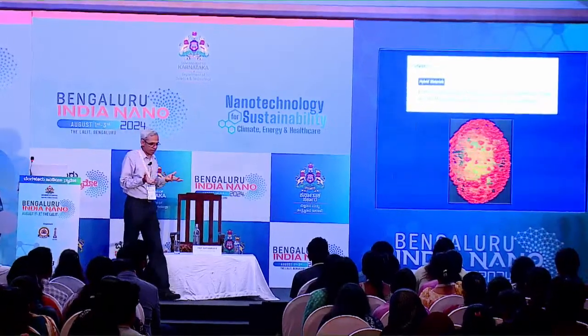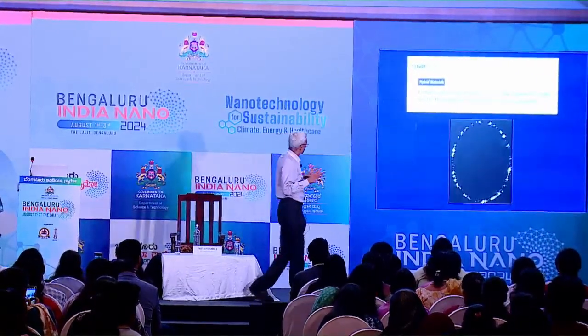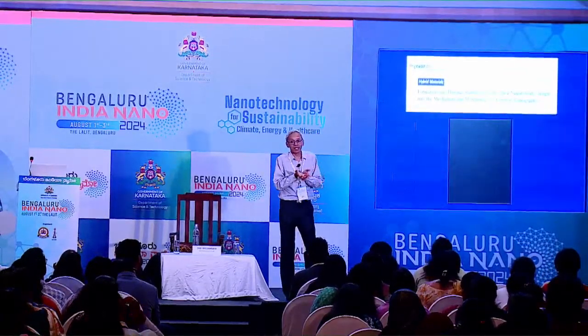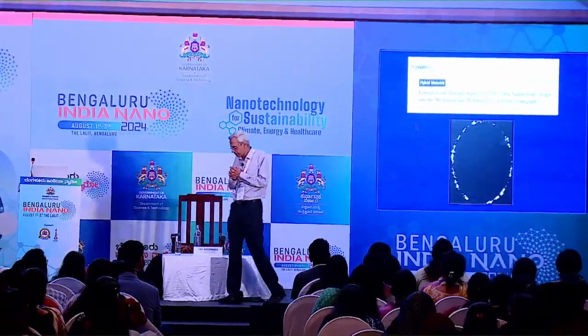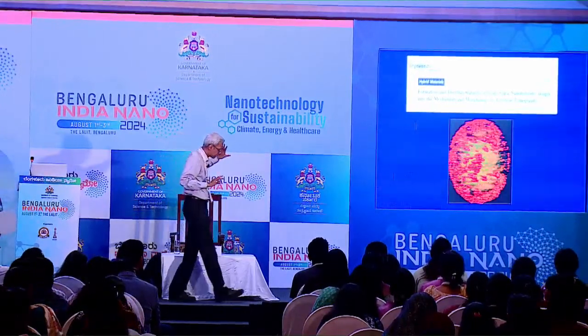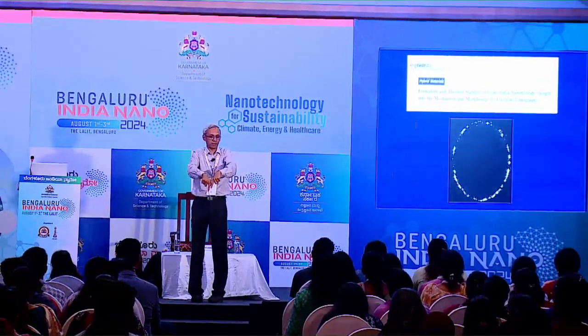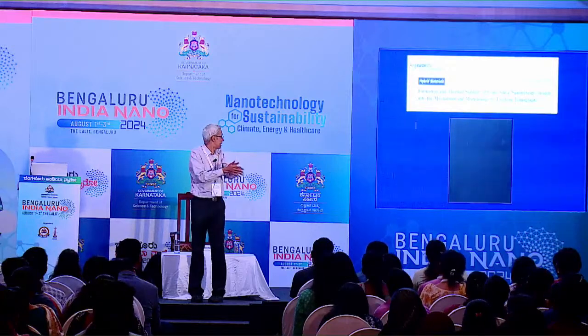This is an example where we had this again done in collaboration with the Antwerp group several years back. We had gold nanoparticles sitting on silica, and we were getting some kind of interesting and bizarre results, which I'm not going to talk about in detail. It turns out that in this particular case, the gold actually was diffusing inside, and it was actually forming things inside.